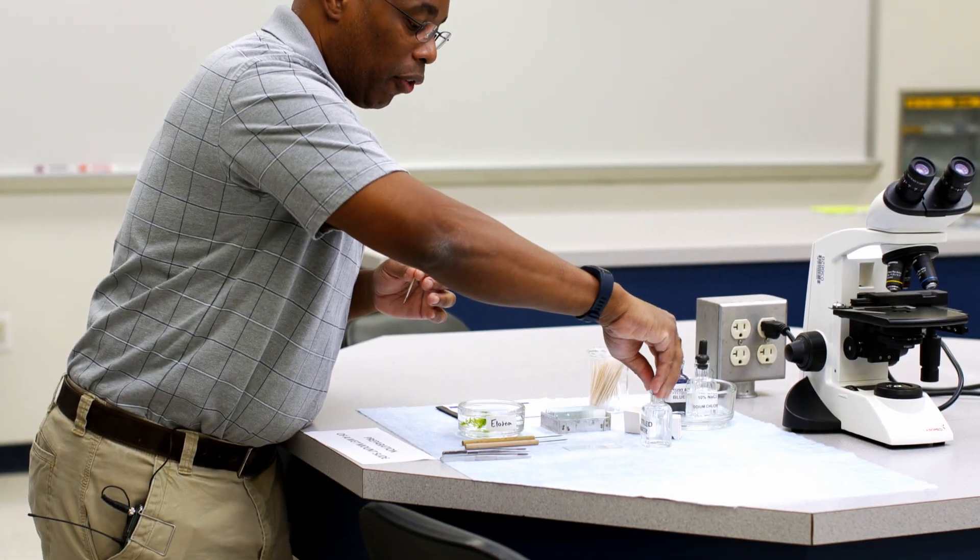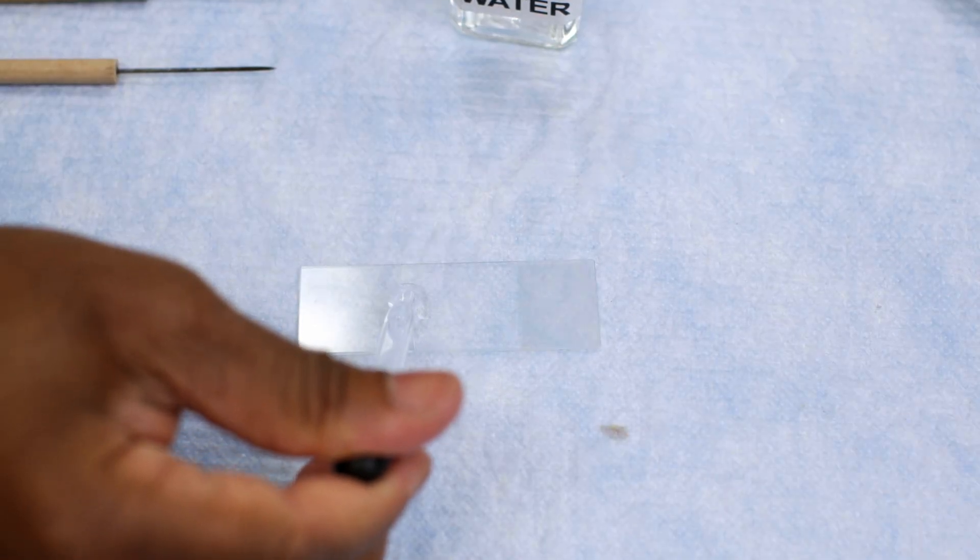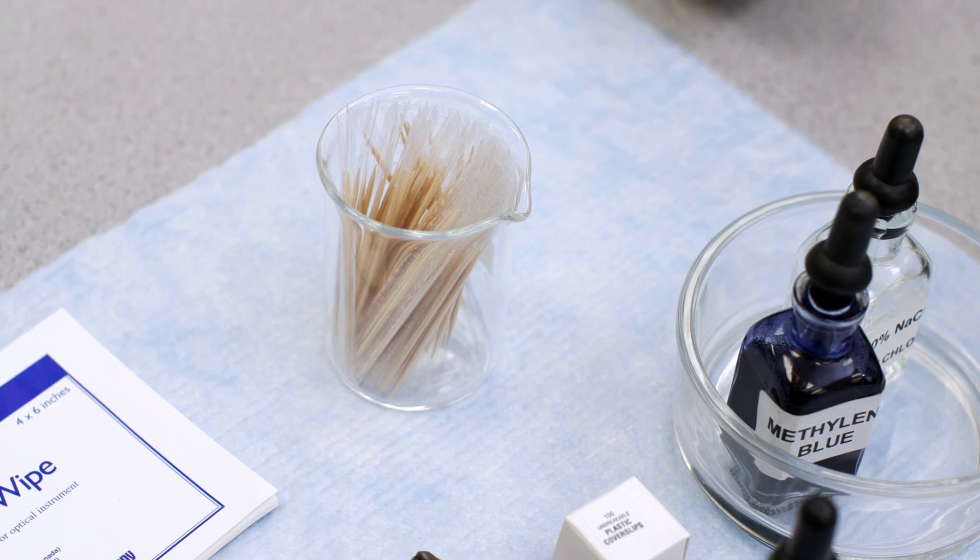The next sample we're going to do is the animal cell. We're going to use humans as the animal, so we're going to take a sample of cheek cells in order to observe how they differ from plant cells. I start with a blank slide, then add a few drops of water. Then, using a fresh, clean toothpick, I'm going to slowly swab my cheeks. We want to gently swab because cheek cells will readily slough off under slight abrasive forces.